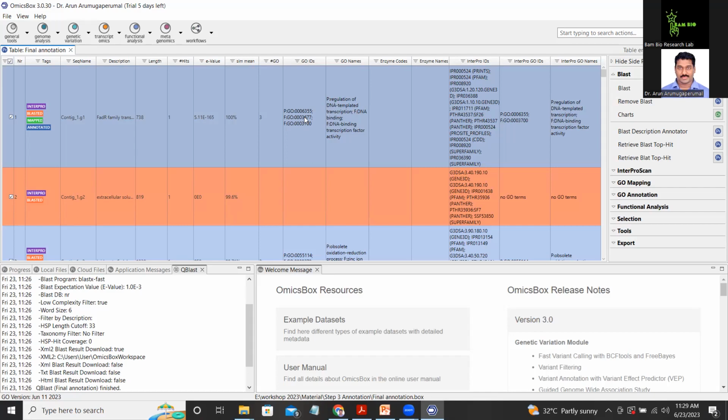So it is better to map the GO terms. We have a BLAST result. We are having a homologous sequence. Homologous sequence means 2 sequences which share a common evolutionary origin are said to be homologous sequences. So if that protein is having a particular GO term, that GO term will also be applicable to our protein of interest, because they are having sequence similarity of 100% or above 90%. So the GO terms will be transferred to our sequences.